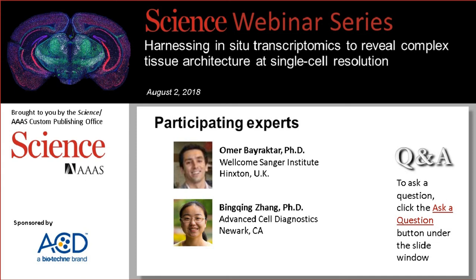Yes. So in our study, we actually intentionally focused on quantifying RNA in the neuronal cell bodies because to be able to attribute RNA molecules to the cell body or the dendrites, you need to be able to segment those cellular compartments accurately.